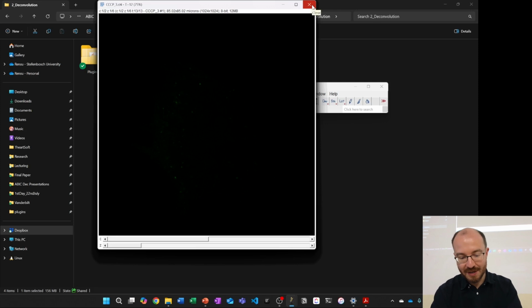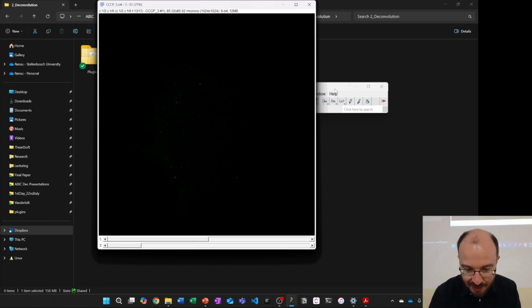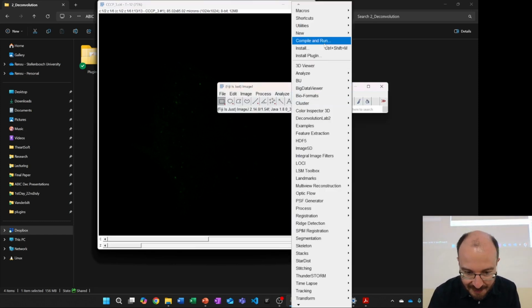Now you usually don't want to do what I'm about to show you manually for every single point in time, because you're going to have 100 images, all of them have 12 time points, you now have 1,200 images. You don't want to manually open up one, deconvolve, open up the next one, manually click deconvolve. So usually we do this with macros. Now I'll turn on the macro recorder just to show you what happens behind the scenes.